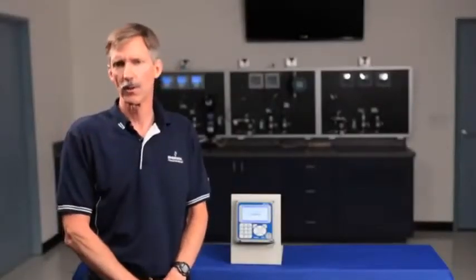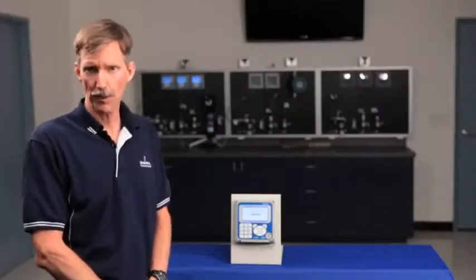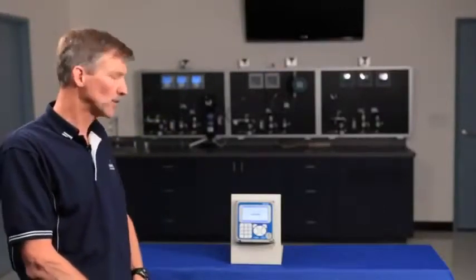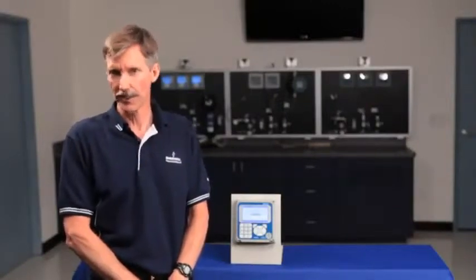Quickstart screens are enabled automatically upon first power-up of the device, and all the user menus and the instructions are available in nine languages, which again, completely eliminates the need for a user manual.